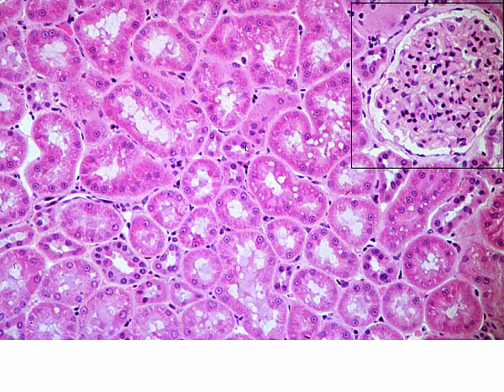Now, pulling back away, we're looking more at our cortical labyrinth, and by and large, the majority of tubules you're going to see are going to be proximal convoluted tubule as we look in the cortex. So here we have our renal corpuscle, Bowman's space, parietal layer, and again, as we're looking at these cross sections, the ones that are taller, the ones that have fewer nuclei present, these are going to be our proximal convoluted tubule. The ones where we can clearly see many nuclei, we can see a distinct lumen, those are going to be our distal convoluted tubule.